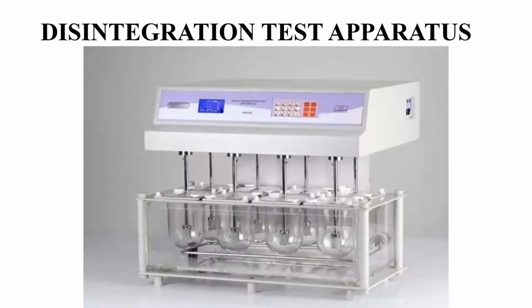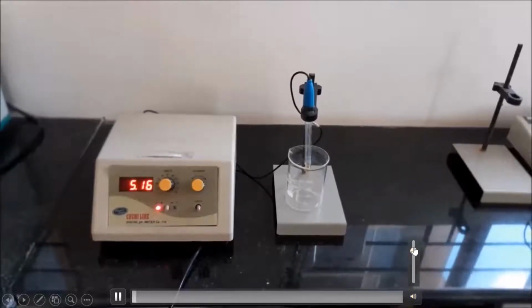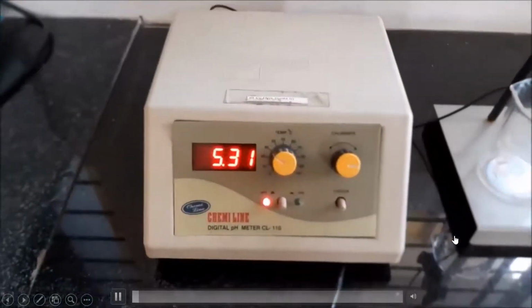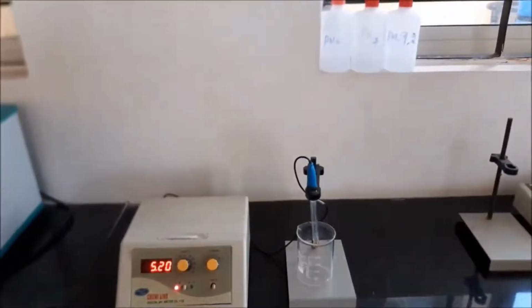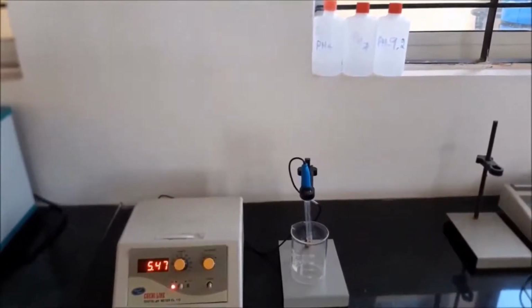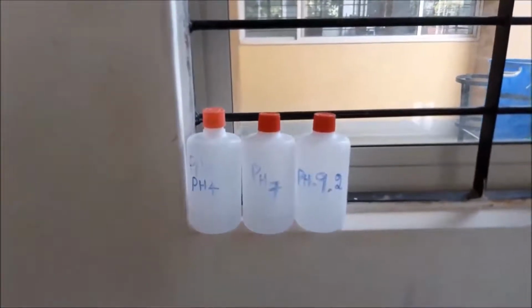Here you can see the determination of pH by a digital pH meter. You can just have a look at this. The instrument seen in the video is a pH meter. The initial setting requires setting the room temperature to 27 degrees Celsius, and the instrument is calibrated before testing samples by calibrating it to 3 different values: 4, 7 and 9.2.